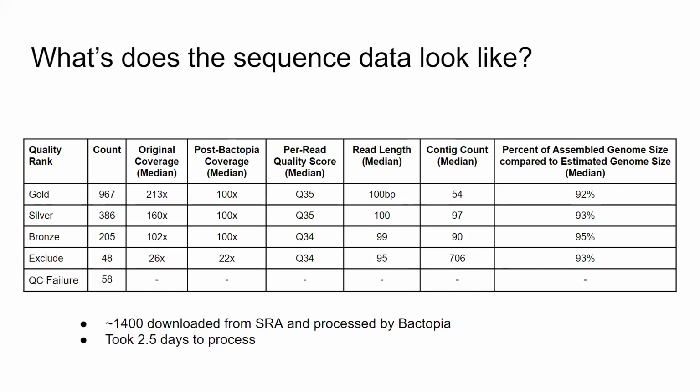And since this is all Lactobacillus genus, the genome sizes in Lactobacillus range from, I think it was 1.2 to almost 4 megabases. So if we were doing something like Staph aureus, we could just set the genome size to 2.8 and use that to downsample all our data. When we're estimating coverage, we need to know a genome size.